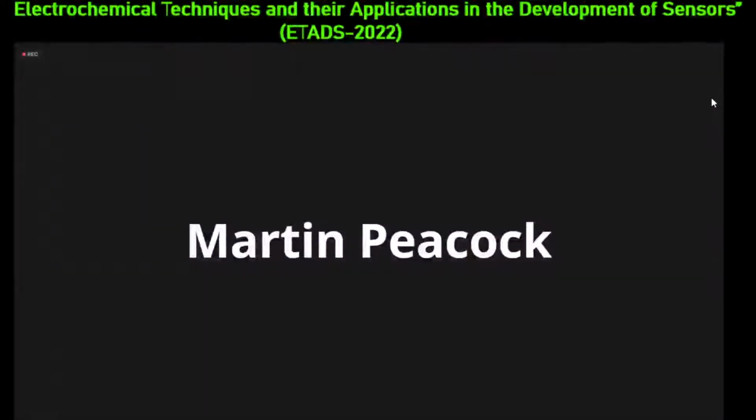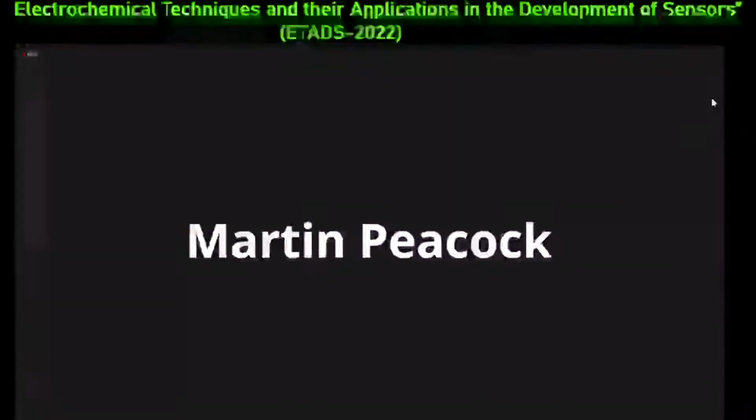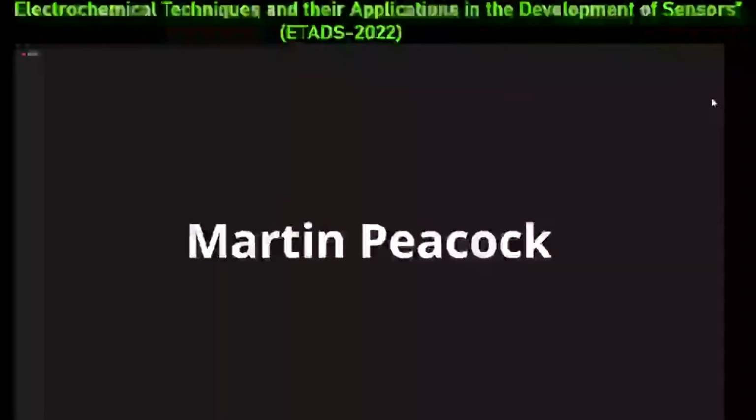All right. So as you do that, I can see that what you've got there in front of you is the screen printed electrodes. So on the far right, they have essentially a screen printed electrode in a connector. They've actually got it on a cable. They've also got a little stirrer in front of them.